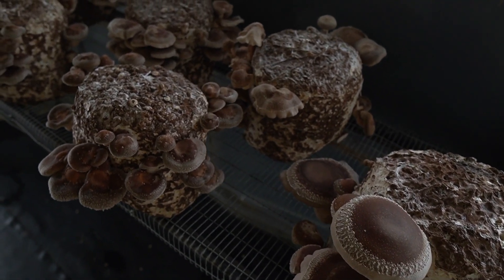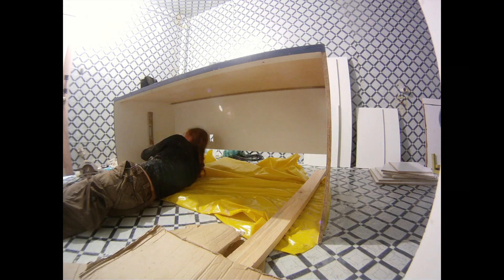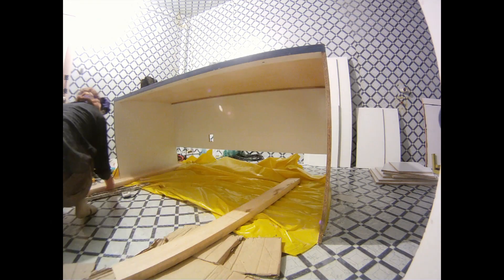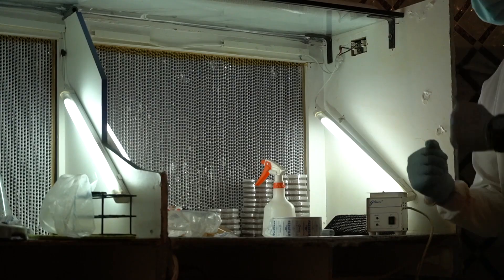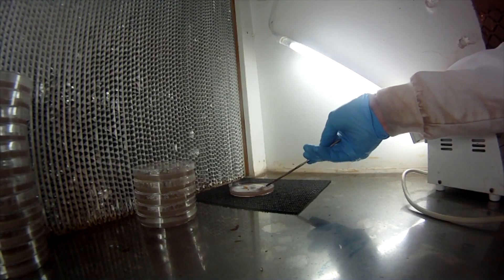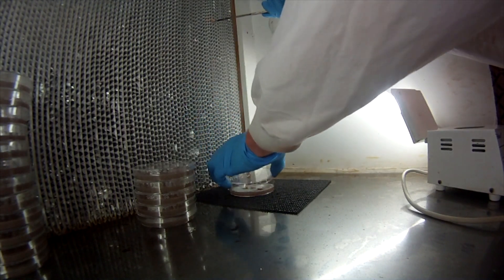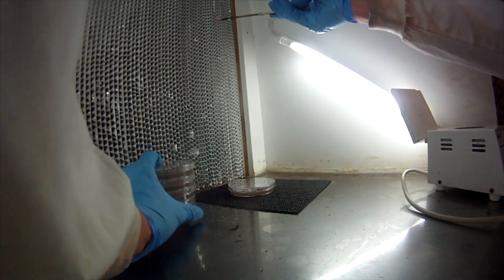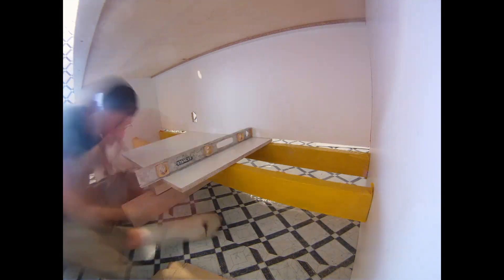Hello y'all, welcome to 5D Lifestyles. We're talking about growing mushrooms, growing fungus specifically. In this video we're talking about building a laminar flow hood. Our last video covered what a laminar flow hood is, but basically it's just a wall of purified air that allows us to do transfers of fungus in our clean room — even safer, because right in front of our hands is 99.999% sterilized air, letting us make transfers safely without letting competitors in.